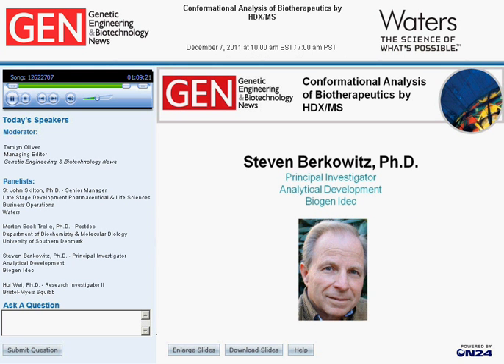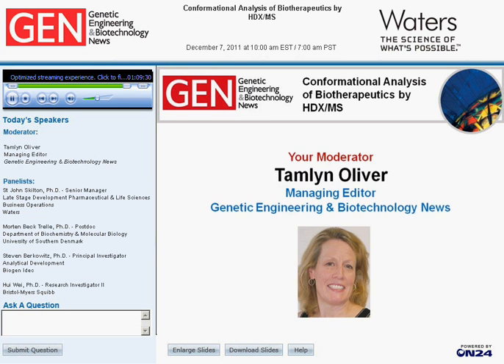Okay, the next question, Steve, I'm going to have you answer first, and then Hoya, I'm going to ask you to comment on as well. Can the local mode of HDX by LC-MS pinpoint the actual location of conformational change?